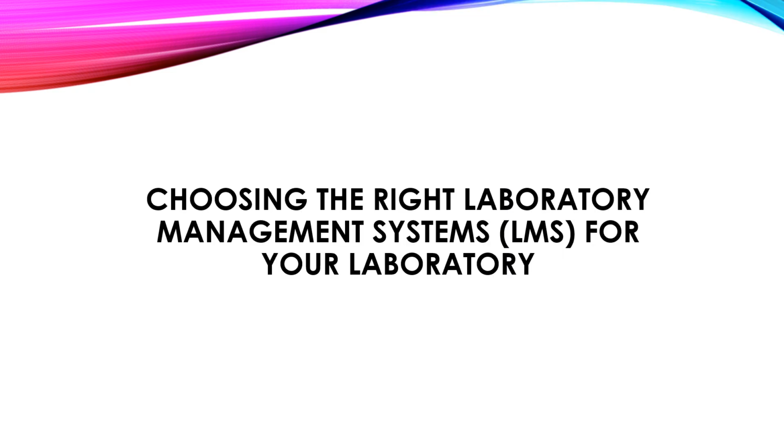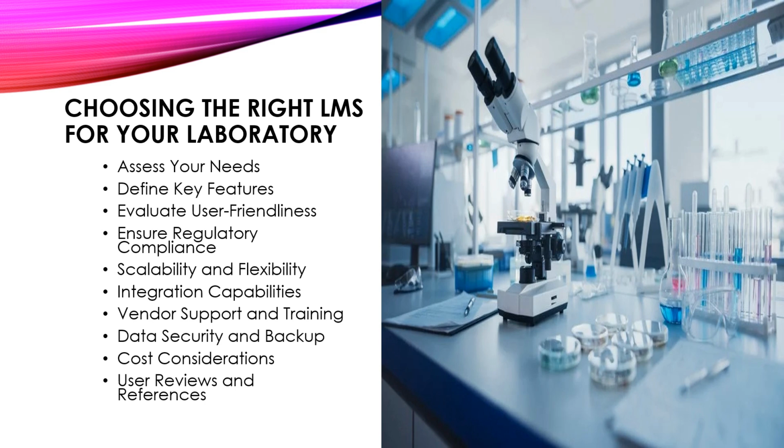Now, how to choose the right laboratory management system for your laboratory. Choosing the right laboratory management system for a particular lab is a critical decision that can significantly impact one's laboratory's efficiency, compliance, and overall performance. And the following is a guide to help you navigate the selection process.